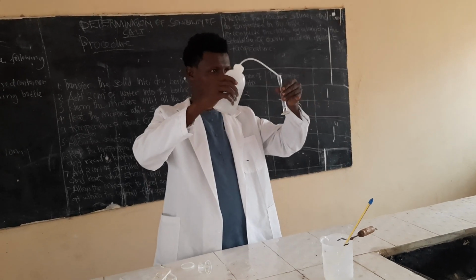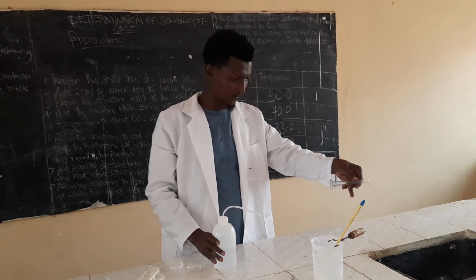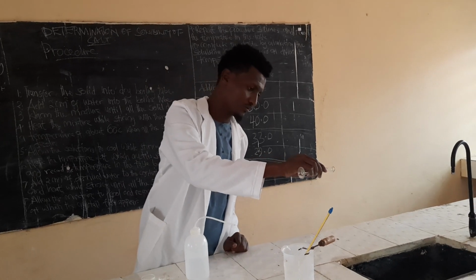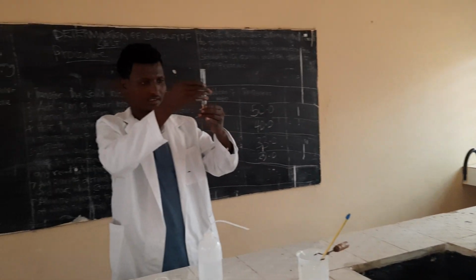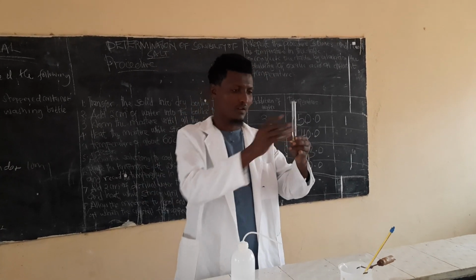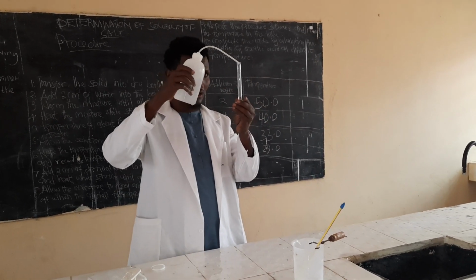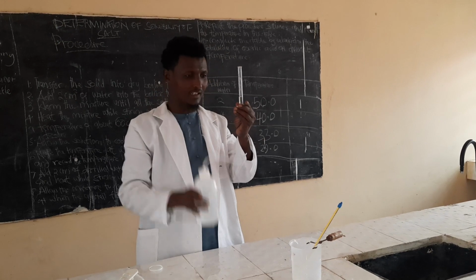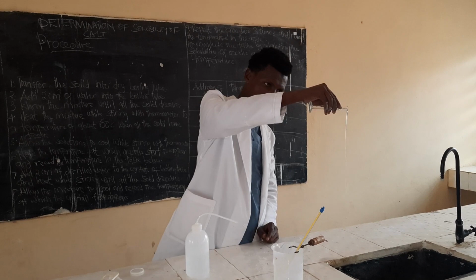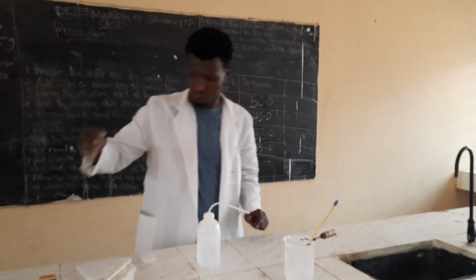Measure 2 all the way along. Remember, this is quantity. If you have not measured exactly, you will get a fake result.